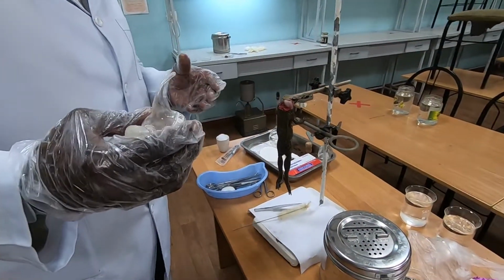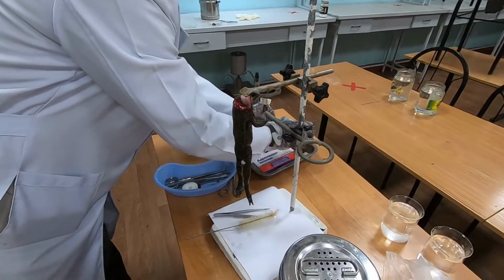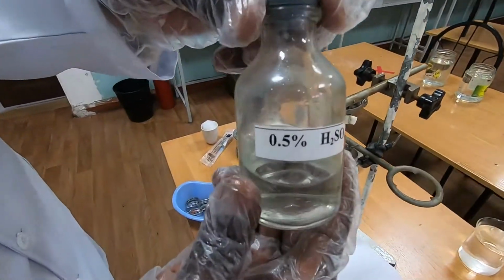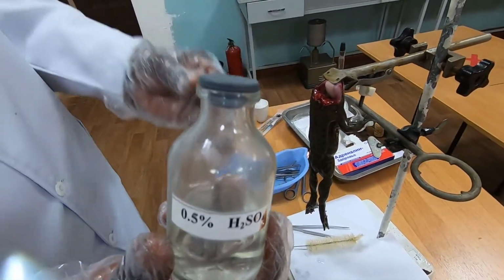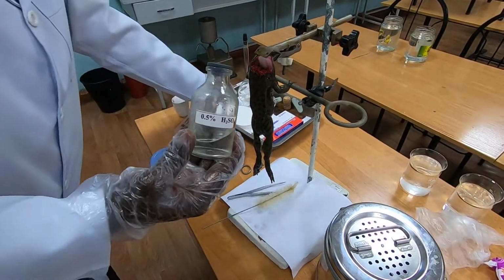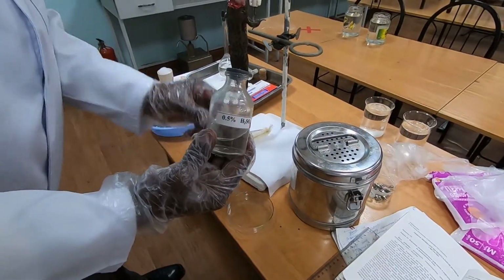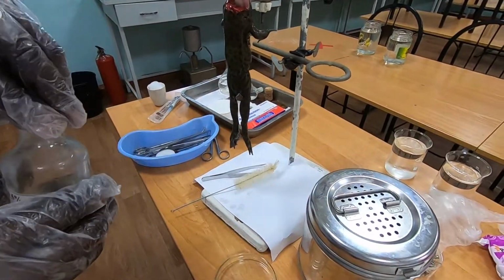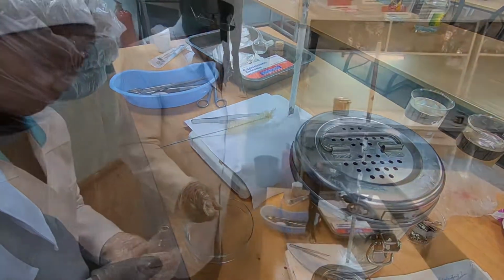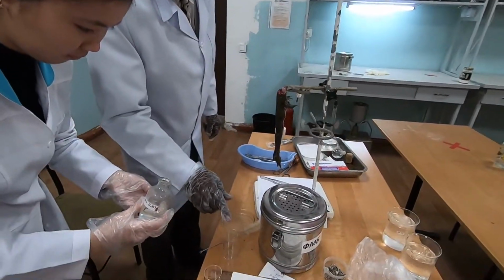Now, the next thing is we're going to use not 1%. We're going to use 0.5% sulfuric acid. All right, we'll see how the frog reacts to it. So dear students, we're going to pour in a little bit of 0.5% sulfuric acid.